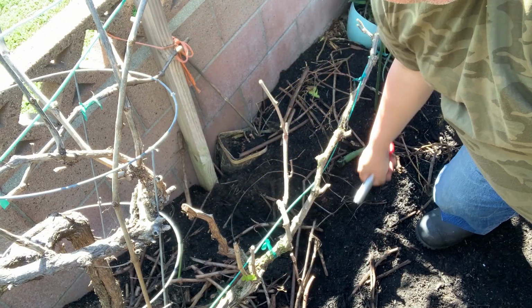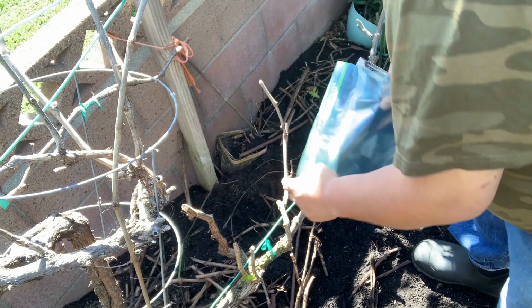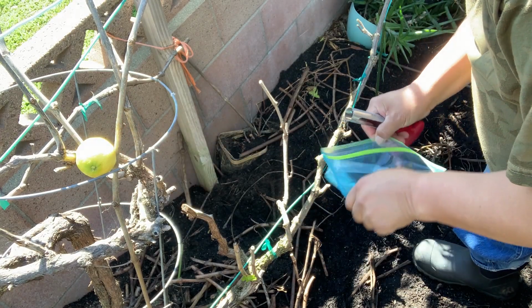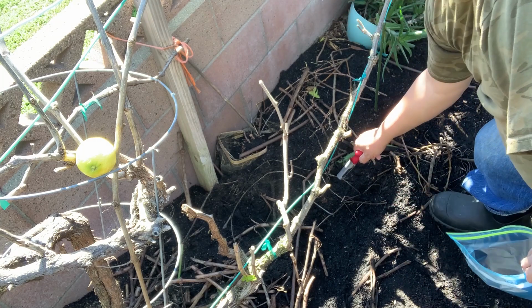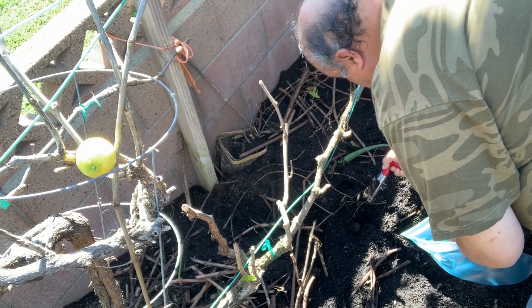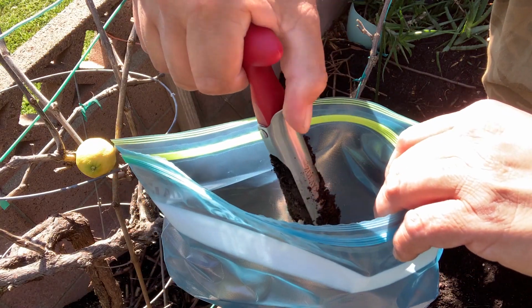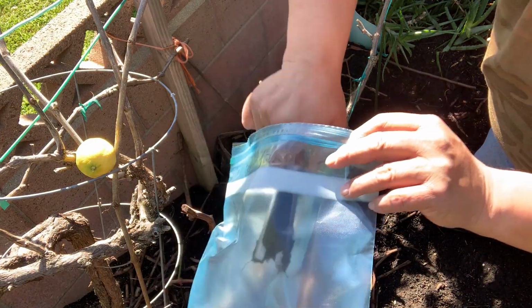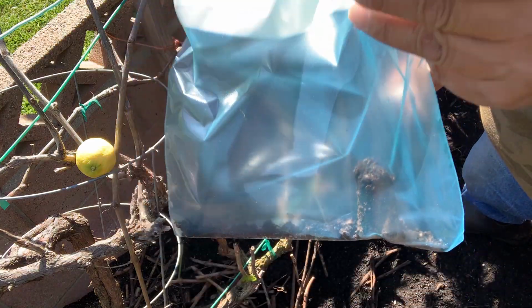All right, so our first sample is gonna be right here. We use this extractor, and we have to bag it. Even got a lemon. All right, so we'll just get a sample from here. Basically, just push it in. You can see right there. Put it in the bag. There it is. There's our first sample.